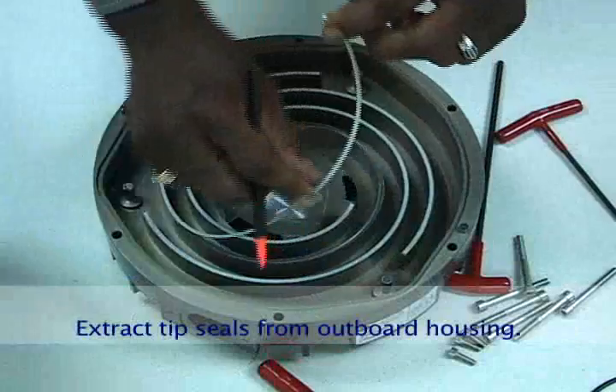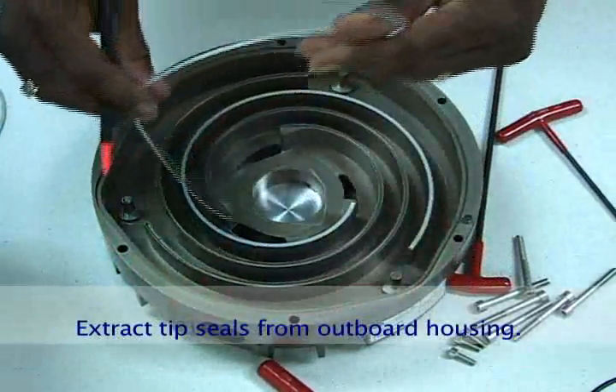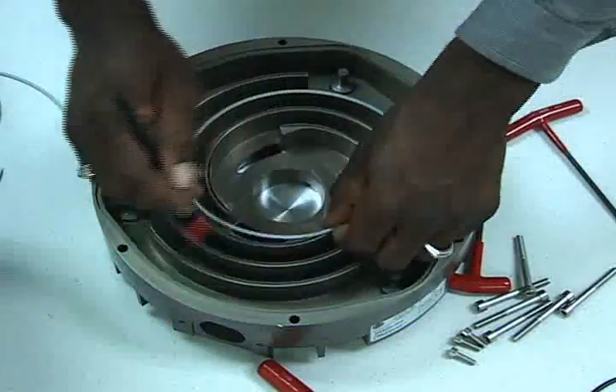Extract the tip seals from the outboard housing. You can use a Q-tip or small pry instrument to pop the tip seal out. Remove both tip seal sections.